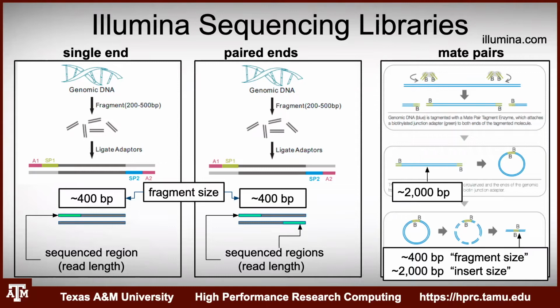These are sequences that are thousands of base pairs long, but are contiguous in sequence. And then you can use mate pair libraries, which are further apart in origin on the genome, in order to scaffold these together. So you can stitch together your contigs to make longer sequences that should align with the whole chromosome. Does that make sense?